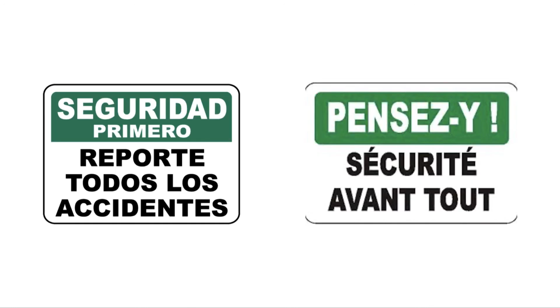So, as the saying goes in any language, no matter whether you're taking French or Spanish, safety first, pay attention, report accidents. This is something that no matter where you are, where you work, where you do things, we want to be safe. And so think safety first as we work in the lab, and feel free to go back and review this video at any time as you prep for the safety quiz. And also, if something happens, I may say, hey, let's go watch the safety video again, but it'll be there.